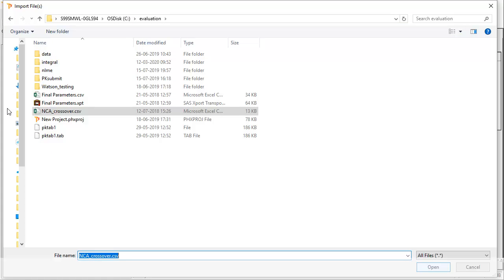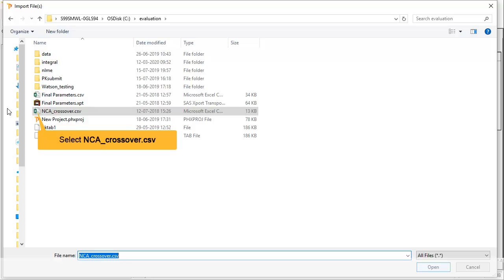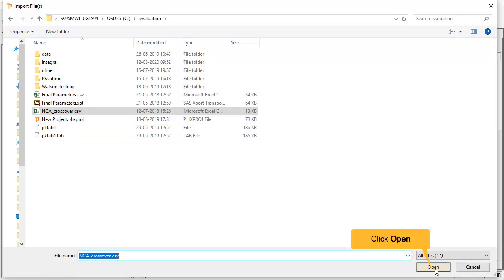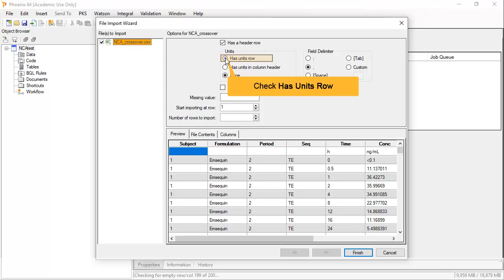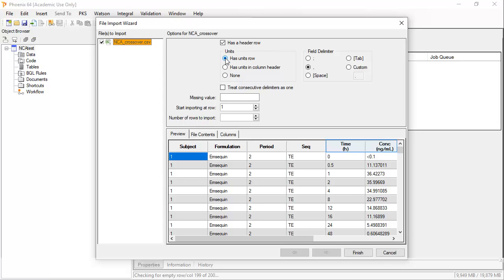Let's import a CSV file, NCA crossover. This file is available for download within this tutorial. Within this import wizard dialog, we can tell Phoenix how the file is structured. Note the worksheet appears to have a units row. Selecting the Has Units Row option sets these as the column attributes. Then we can click Finish to complete the wizard, as there is only a single datasheet.